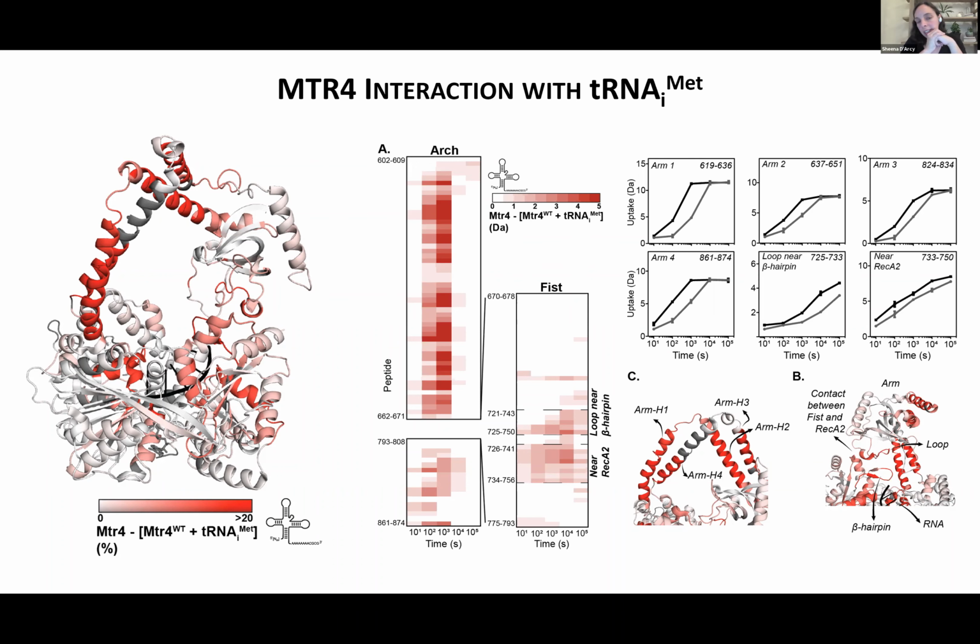I don't really feel equipped to comment, firstly because we haven't really done any protein folding work, although you could just be talking about unstructured regions. Perhaps they're talking about the more transient conformational changes when a protein structure is unfolded, when you have a binding of a substrate or an antibody. Can you capture those intermediates?